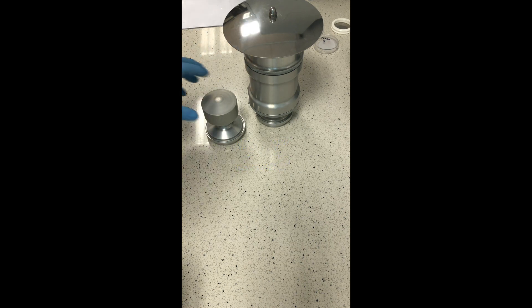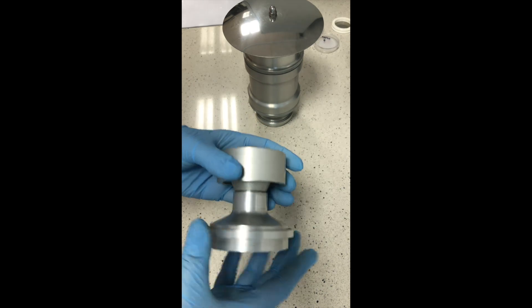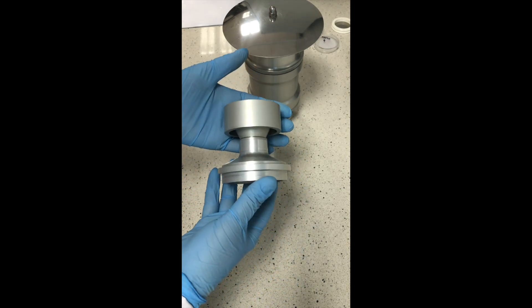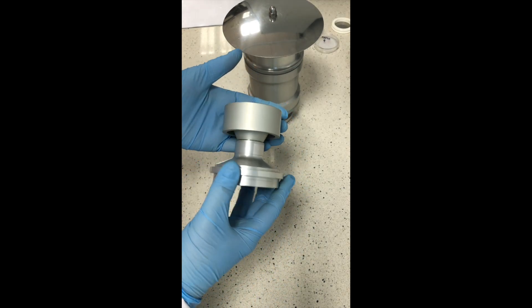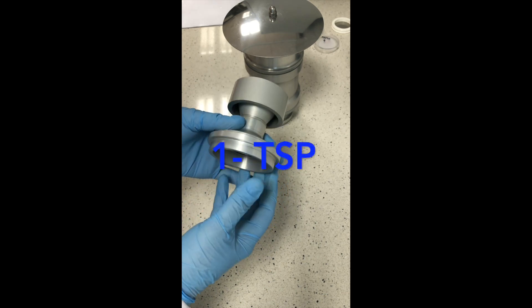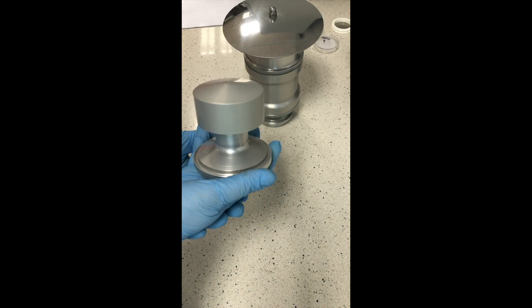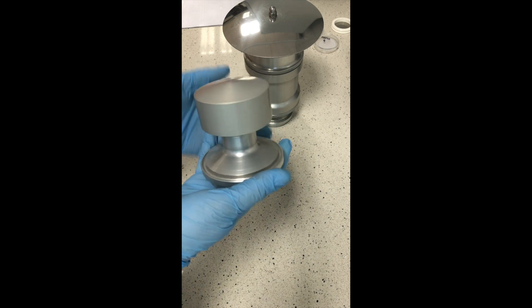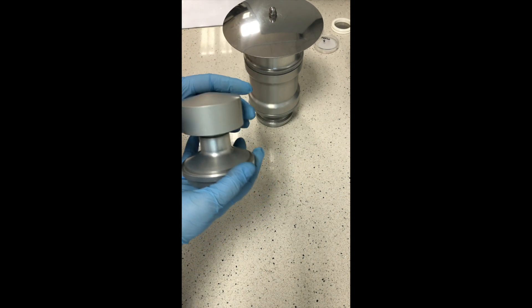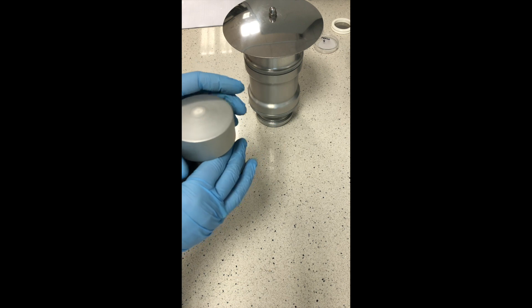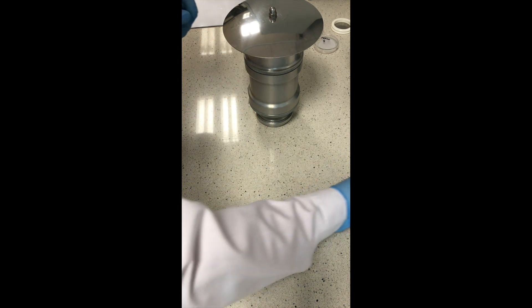Here I have three measuring heads. The first one is this measuring head to collect the total suspended particles. We have only the head that is protecting the equipment from the very big particles, higher than 100 micrometers.